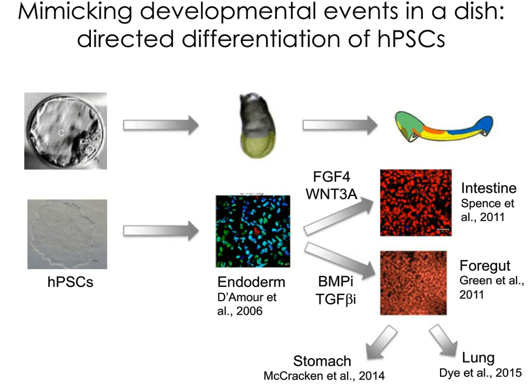Okay, so this is a summary of several published studies, both by my lab when I was a postdoc in Cincinnati and by others, showing that we've been able to take these different embryonic cues and mimic development in a stepwise fashion, whereby you start with an undifferentiated pluripotent stem cell, and you can treat it with activin A to generate endoderm, shown in the middle panel with the green-blue cells. And then we can further pattern this endoderm. You can think about this endoderm as a naive sheet of cells on a tissue culture dish that has the capability to give rise to any of those different endodermally derived organs.